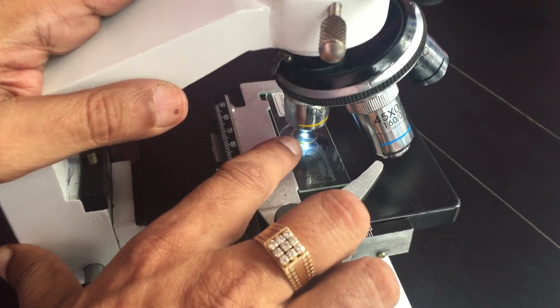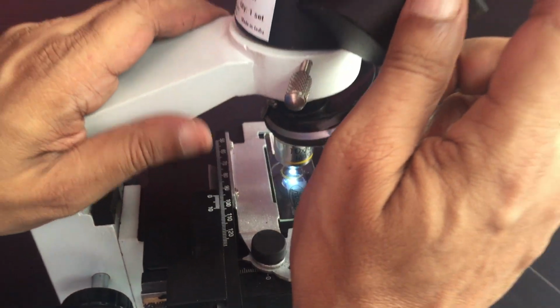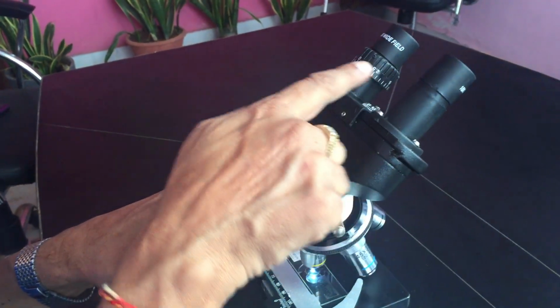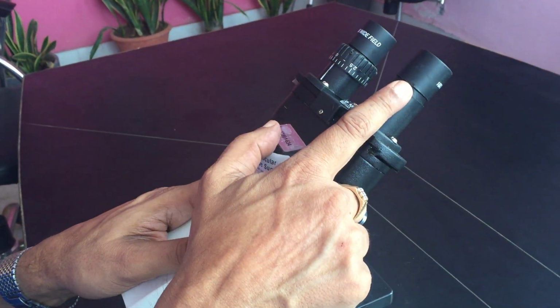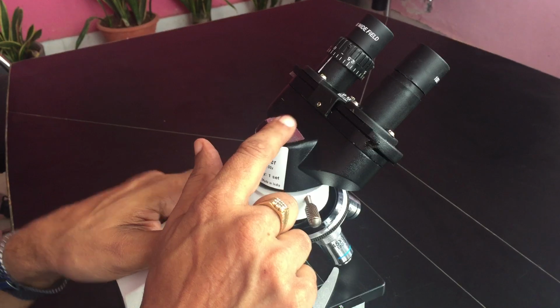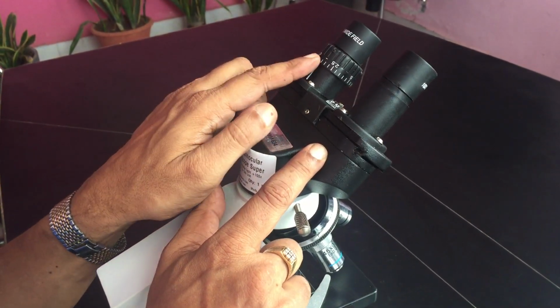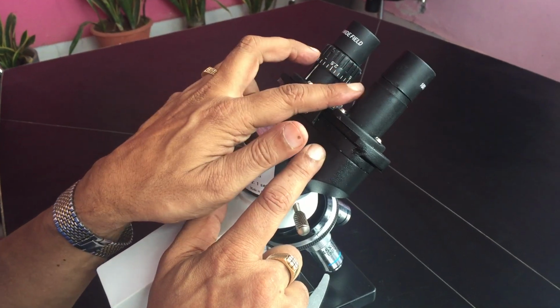First of all, you have to adjust with your left eye. This is with the left eye. This is without any graduation. This is with graduation. Focus the left eye through this eyepiece, and then by moving this you can adjust the right eye so that both the eyes can see together.